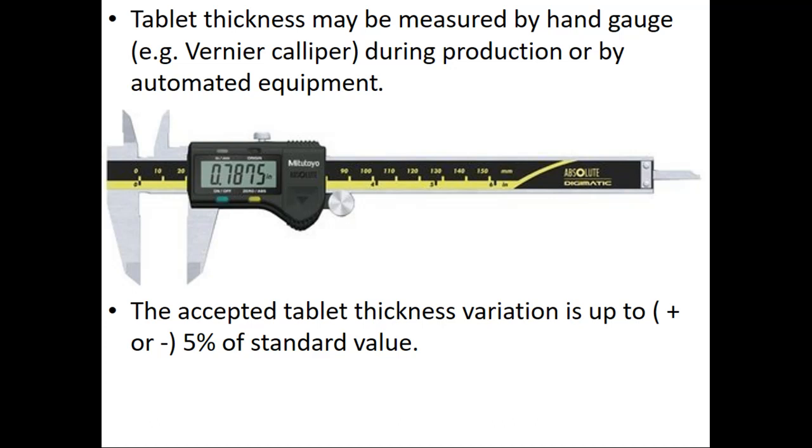The accepted tablet thickness variation is up to plus minus 5% of standard value.